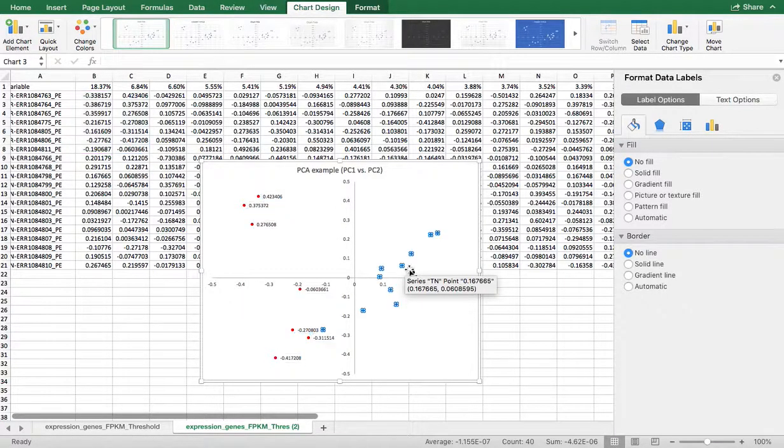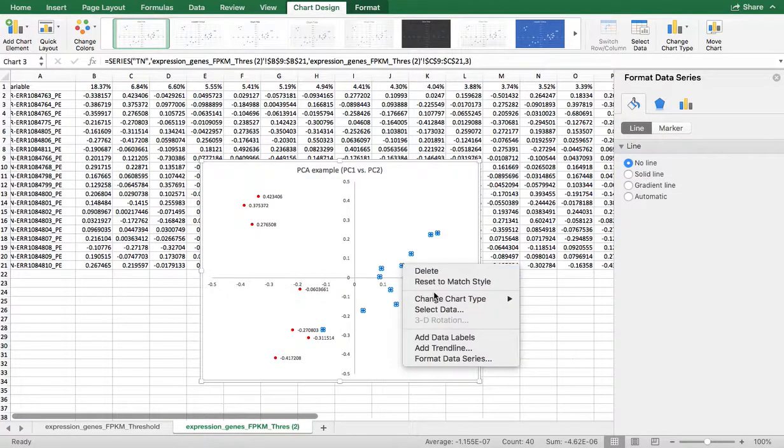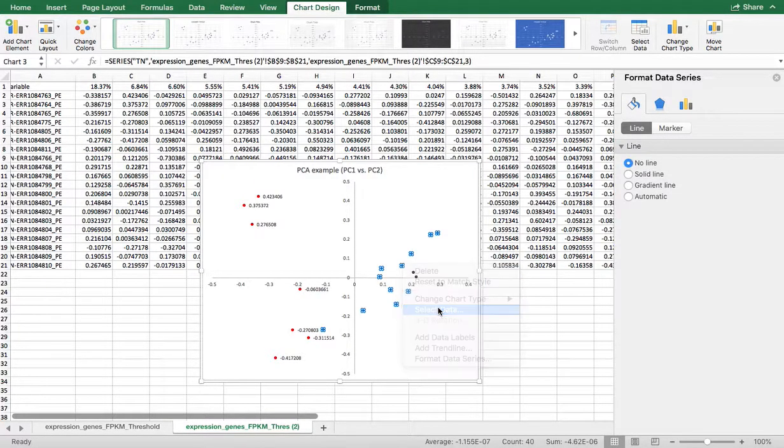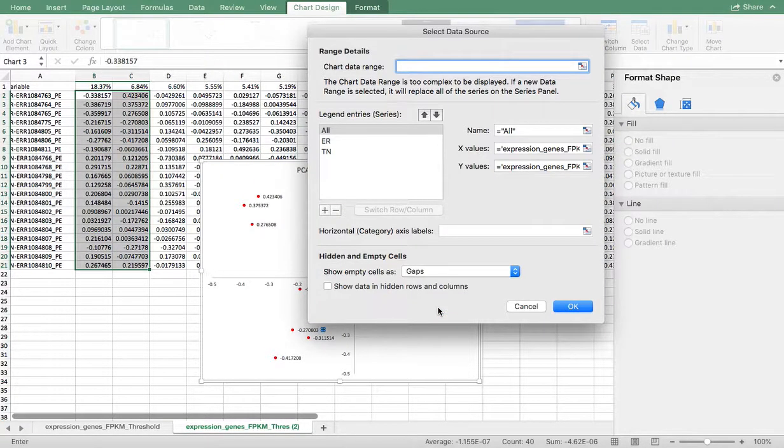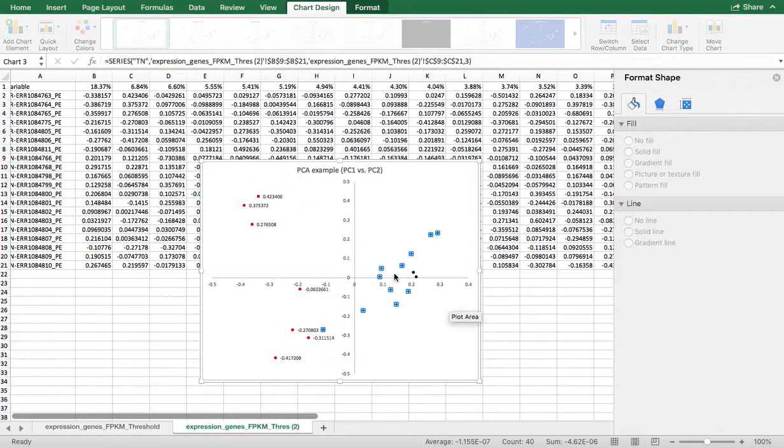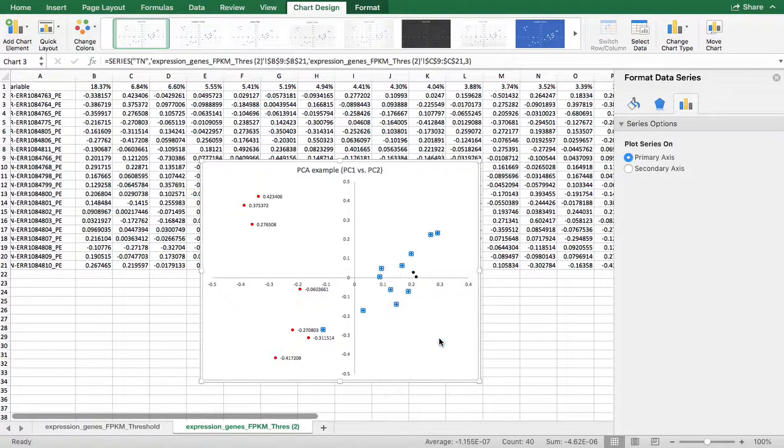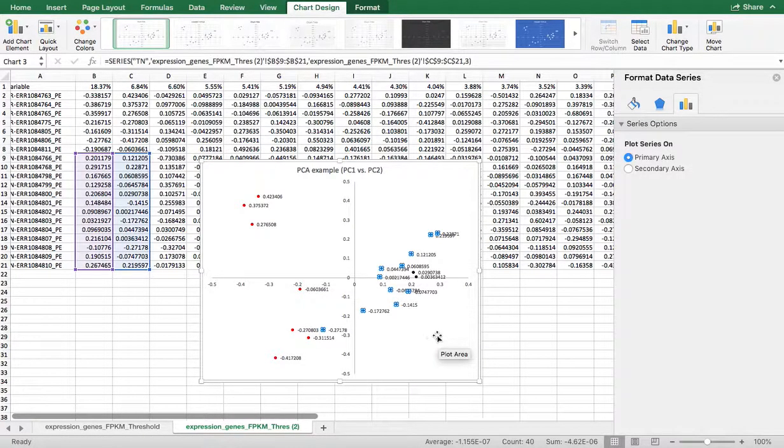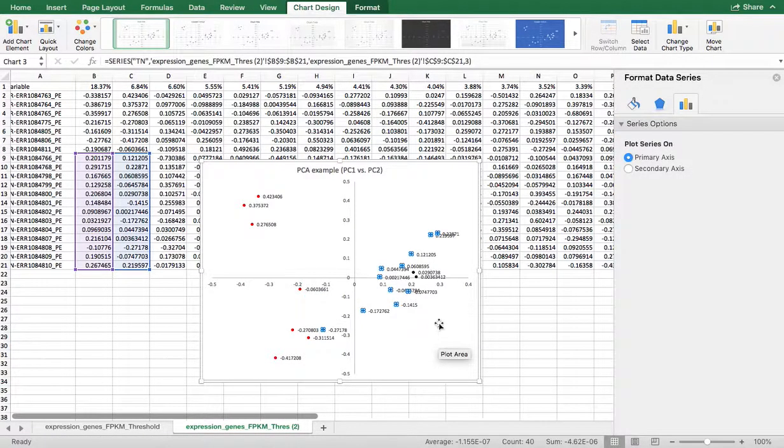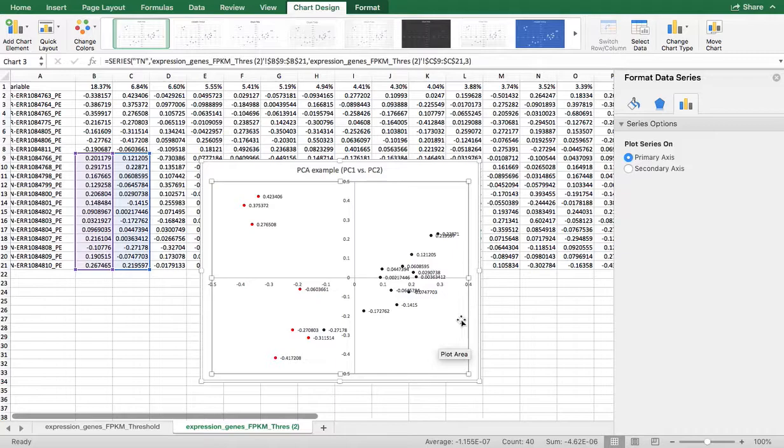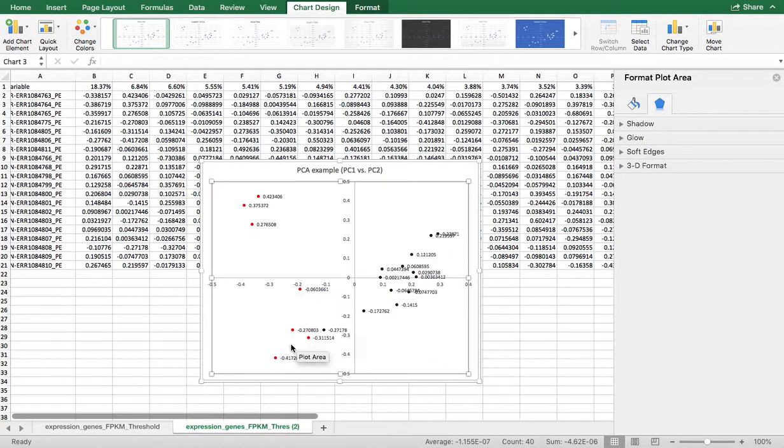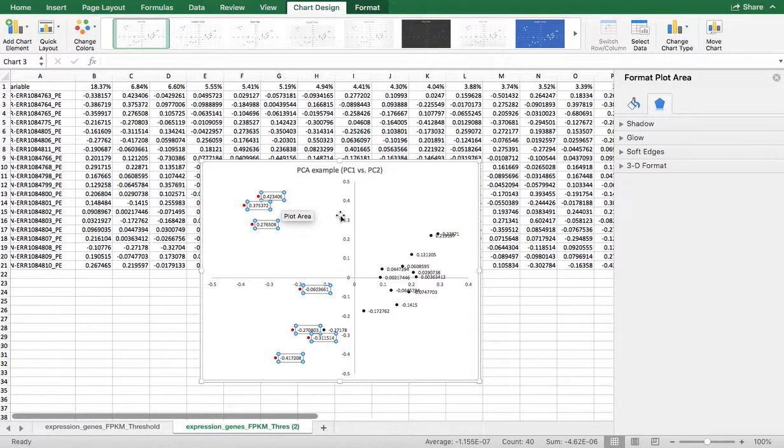So what can you do? This is 0.4. Unfortunately, this is a Mac, so there's not a lot that you can do automatically. Add data labels. Now I can have data labels for all of my dots.